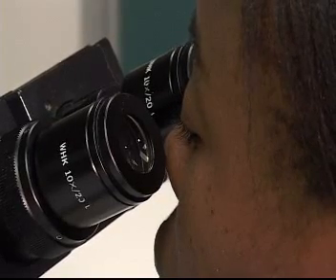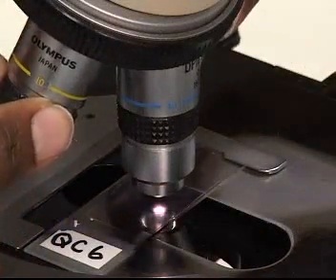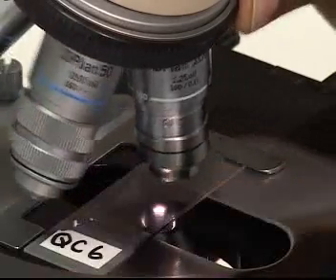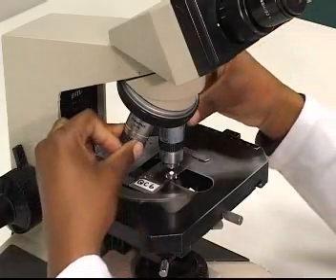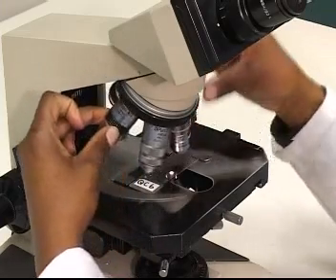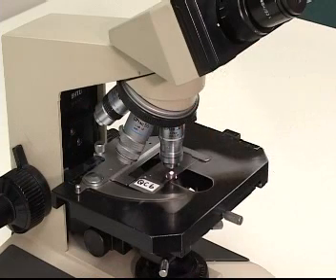Once your object is already in focus under the middle power, you can focus it using the high power objective. Taking hold of any two objectives, rotate the nosepiece until the high power objective clicks into position. Take care that the objectives do not hit against the stage clips when moving them into position. Now you can focus with the fine adjustment until you get a clear image. Remember that you should never use the coarse adjustment when focusing with the high power objective.